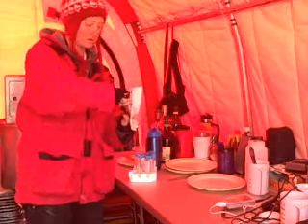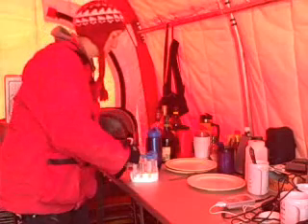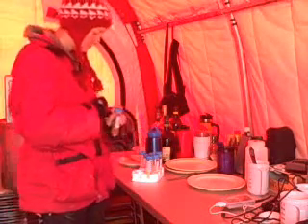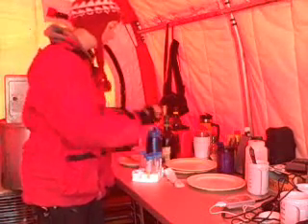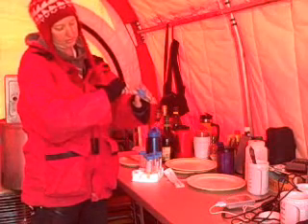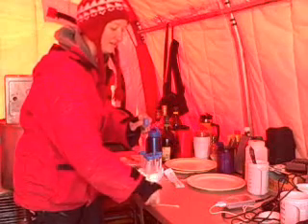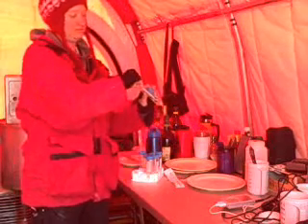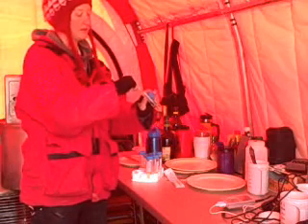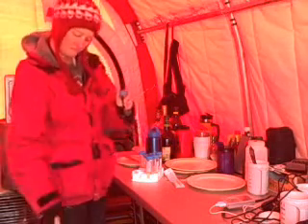There's one. Second one. Swab it all over there. Swab it inside. And we're done.